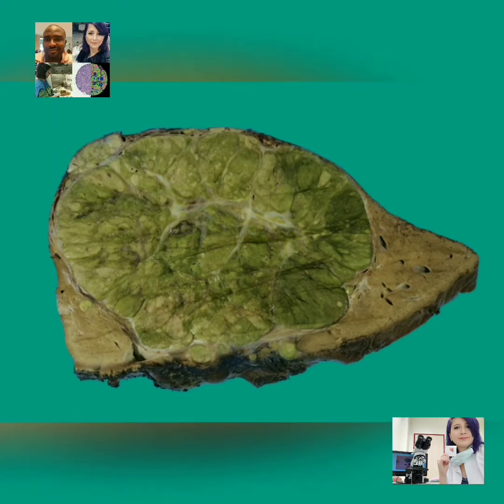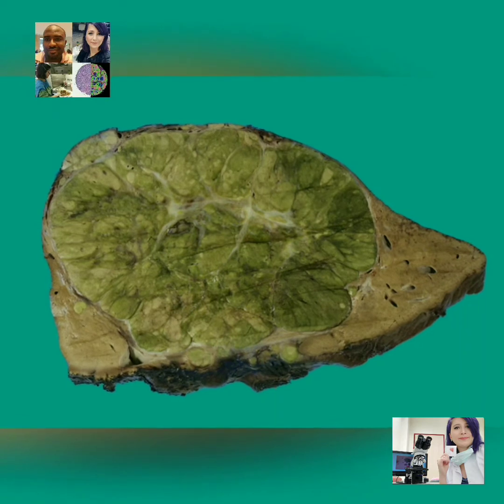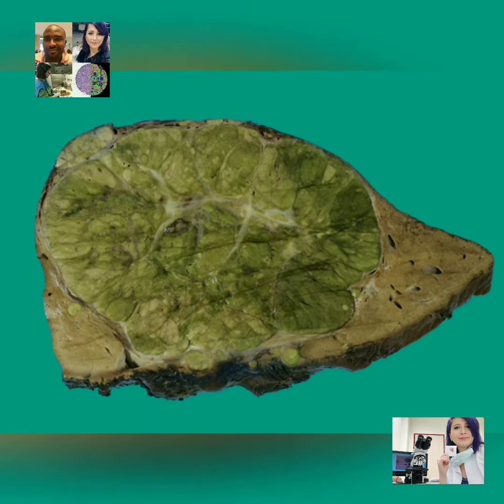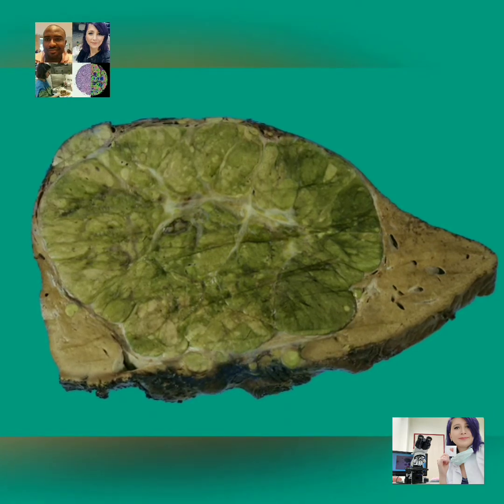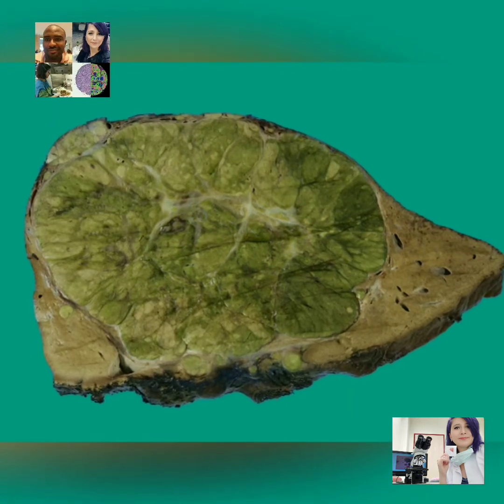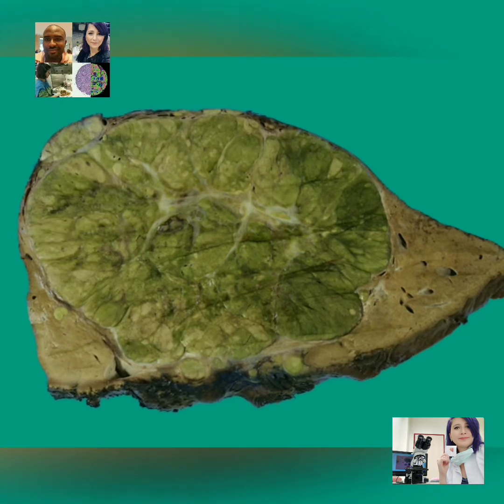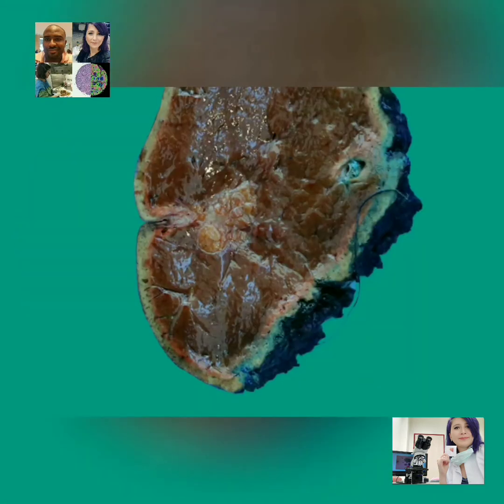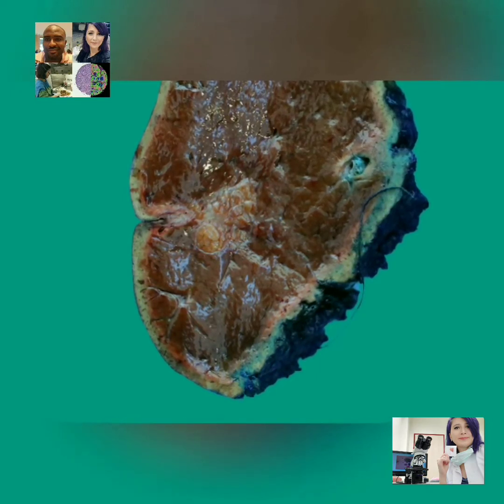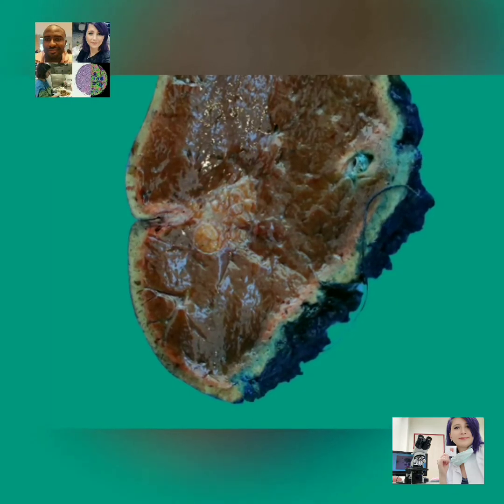Thus, a frozen section may be done for intraoperative consultation, where a timely feedback is required by the surgeon. A touch imprint cytology is also another way of examining fresh tissue. Fresh tissue could also be sent for microbiological culture and sensitivity when infectious diseases are suspected. Most times, liver tissue, when received fresh, is divided with some fragments placed in fixatives for further processing, while the remaining fresh tissue is used for frozen sections or touch imprint cytology as the case necessitates.